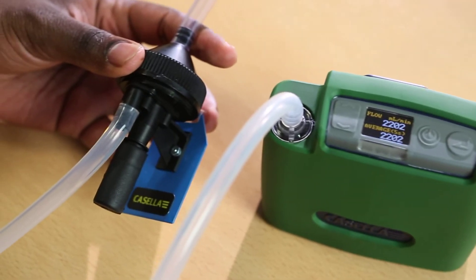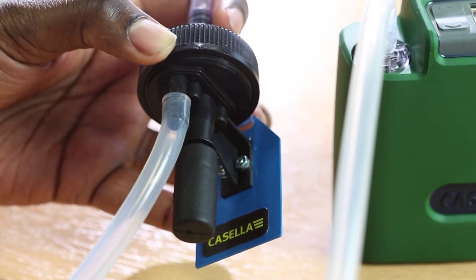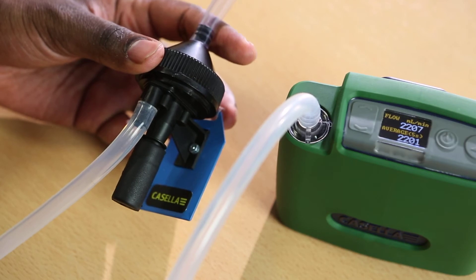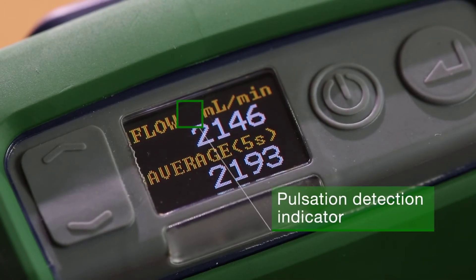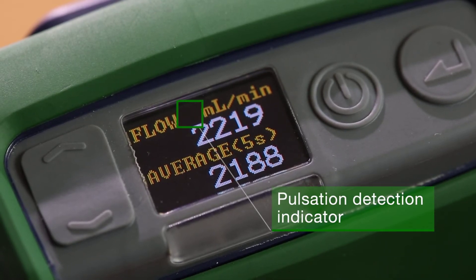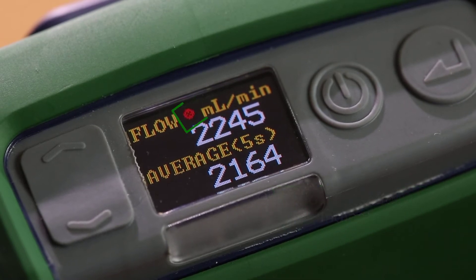Flow calibrators are typically used to check flow performance within 5%, but international standards also require pulsation to be below 10%, which has previously been impossible to check. The Flow Detective is the only flow meter on the market to check if pulsation is exceeding 10%.